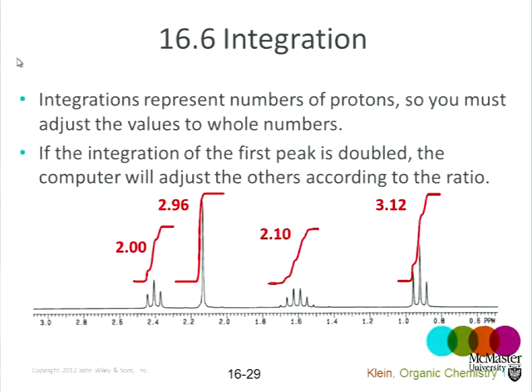How else can we interpret this information? Let's add all the hydrogens together. How many hydrogens are there in the molecule? 10, right? Yes? So we've got 10 hydrogens in this molecule, and no more, otherwise we would see other signals from other hydrogens. Suppose we have the carbon NMR. We've counted the number of carbons from the carbon NMR, right?